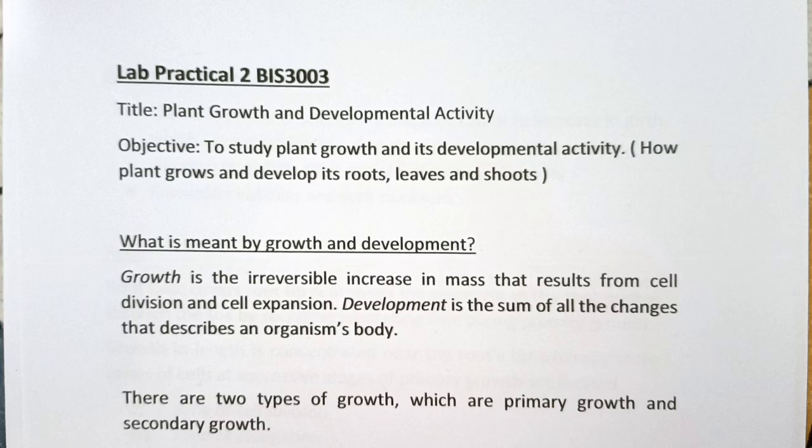A very good morning, I'm Dr. Razifah, and today I would like to explain about my lab practical report for BIS3003. The title of the lab report is about plant growth and developmental activity, and the objective of my practical report is to study plant growth and its developmental activity, which is how a plant grows and develops its roots, leaves, and shoots.